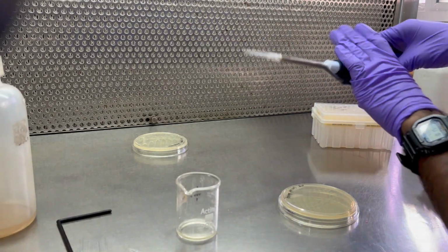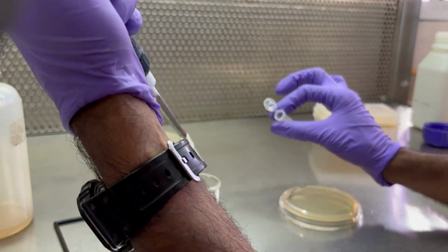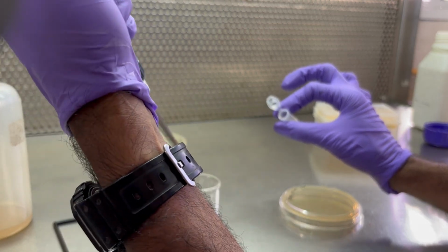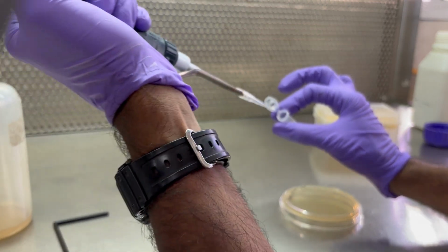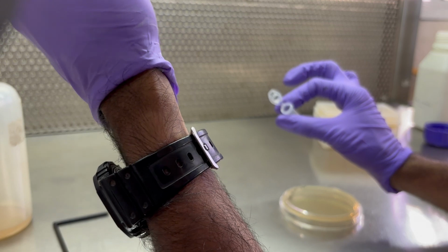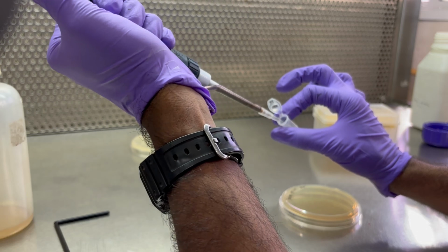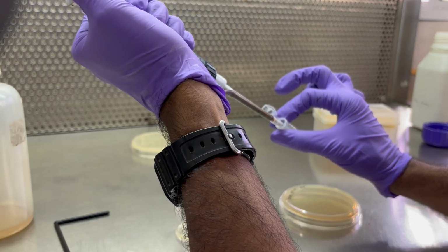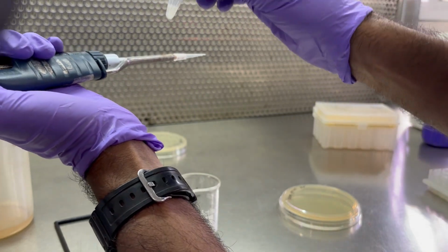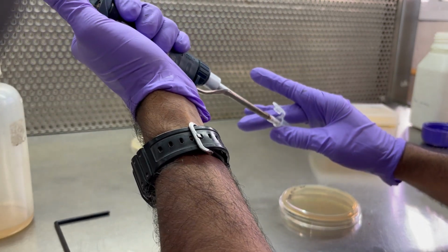Now, after pelleting down the cells, we need to discard the upper supernatant, which is approximately 700 microliters, because I have added 800 microliters of the LB broth. Now we will remove the 700 microliters of the Luria Bertani supernatant, and we will keep the 100 microliters of LB, and we will resuspend the cells in that 100 microliters of LB broth, and then we will plate it on the appropriate antibiotic. So this is how it looks after resuspending the pellet with cells.